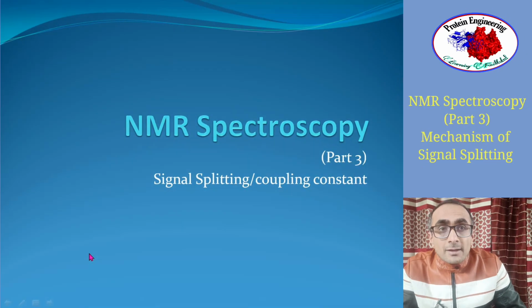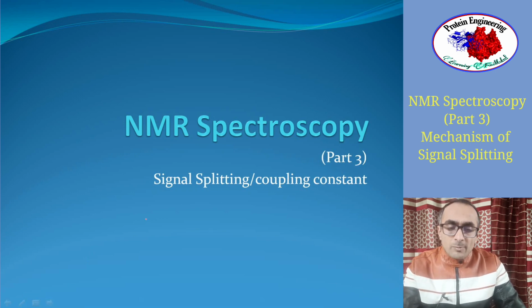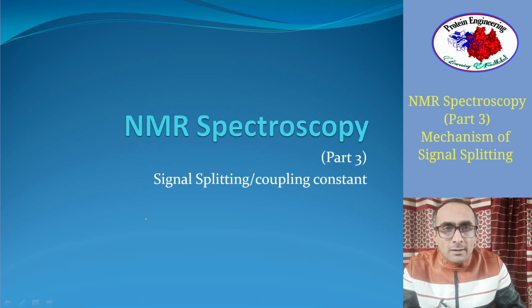Hello everyone. In the earlier lectures, we have discussed the basic principle of NMR spectroscopy and some aspects of interpretation of NMR spectra. In today's lecture, we will talk about signal splitting and coupling constants in NMR spectroscopy.